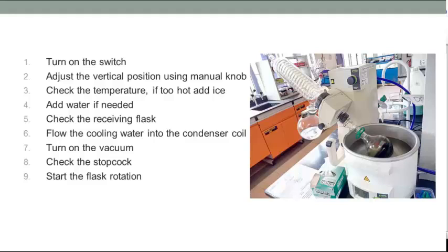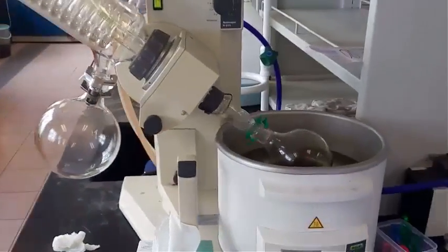Hold the evaporation flask with your right hand and release the vacuum with the stopcock with your left hand. Once the vacuum is released, carefully remove the flask. If it's stuck, unscrew the white flask remover to help push the flask off. Only after the flask is removed, you should turn off the water aspirator and the condenser water. Remember to empty the receiver flask of any waste solvent.